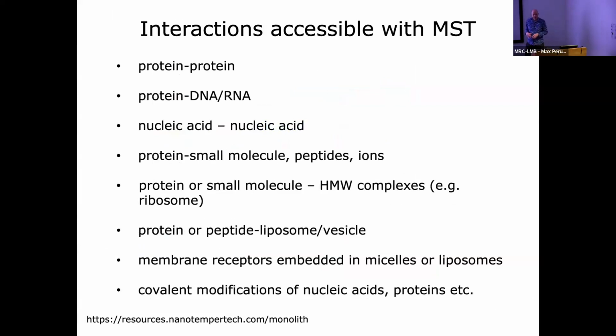The reason why the MST is good: well, we've tried lots of different biomolecules, and it's worked for them. Vesicles, even ribosomes, DNA, RNA, everything. Of course, one component has to be labeled.